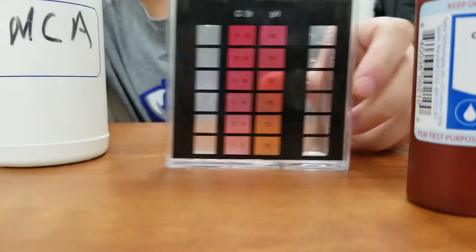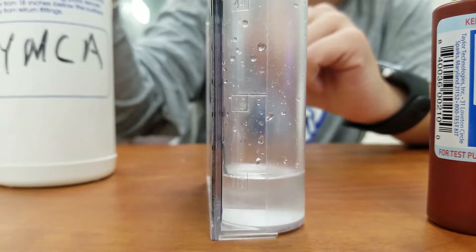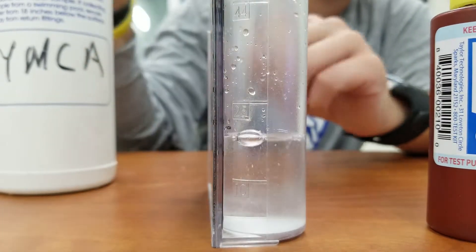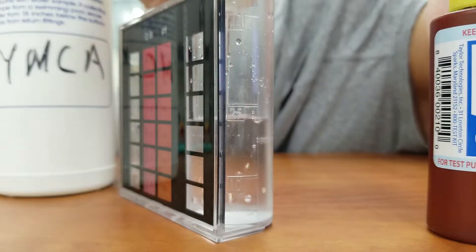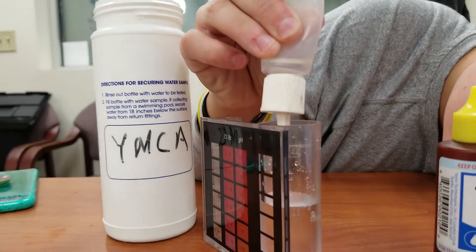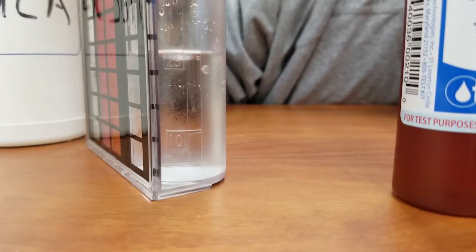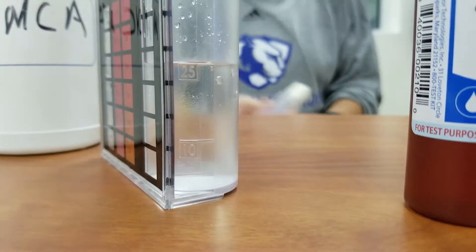We're going to take our large compartment or tube and fill it up to the 25 mark. Again, we're going to use the bottom of the bubble, the surface tension there to get to that 25 mark. We're using a little dropper with a sample of water. Okay, and that gets us up to our 25 mark.